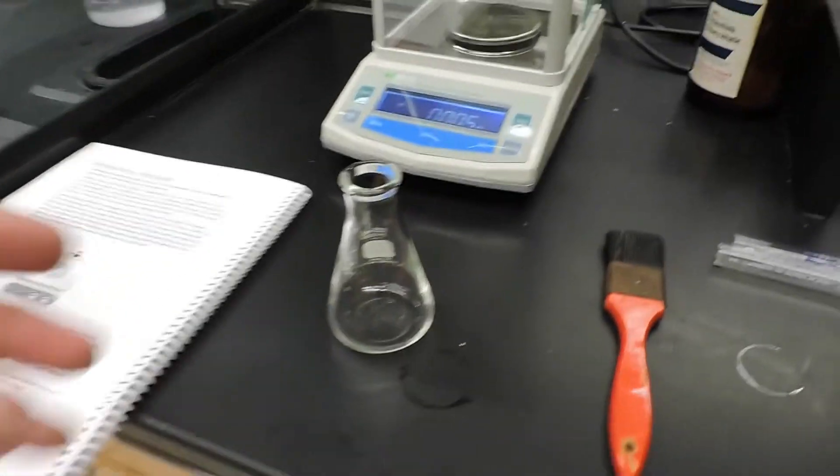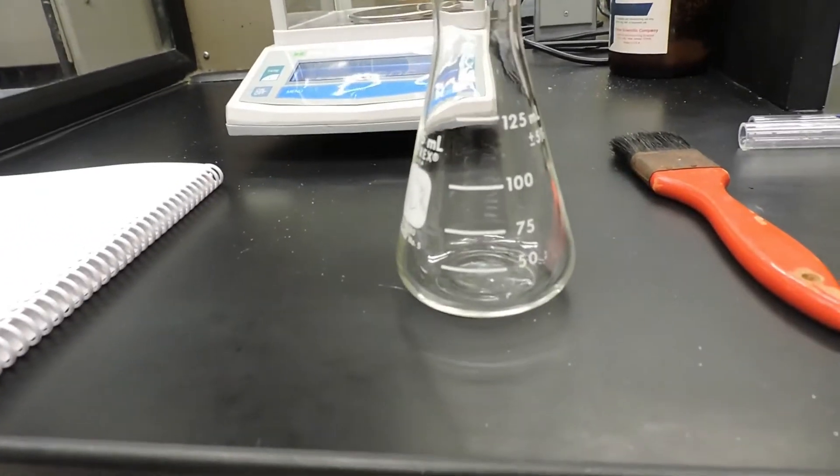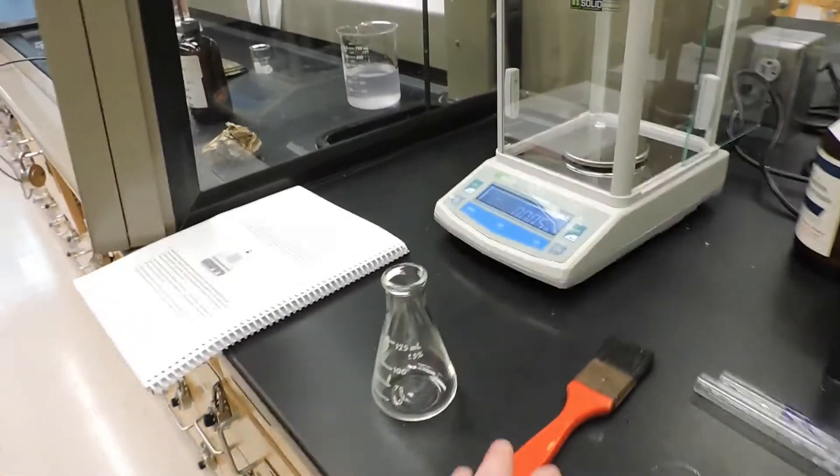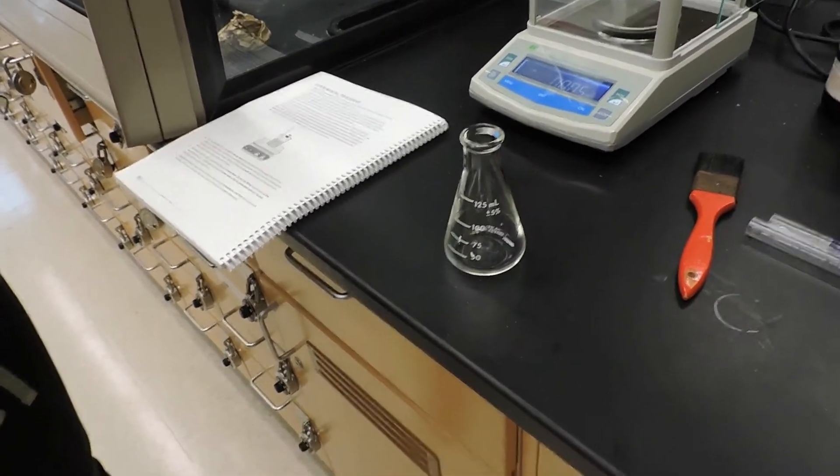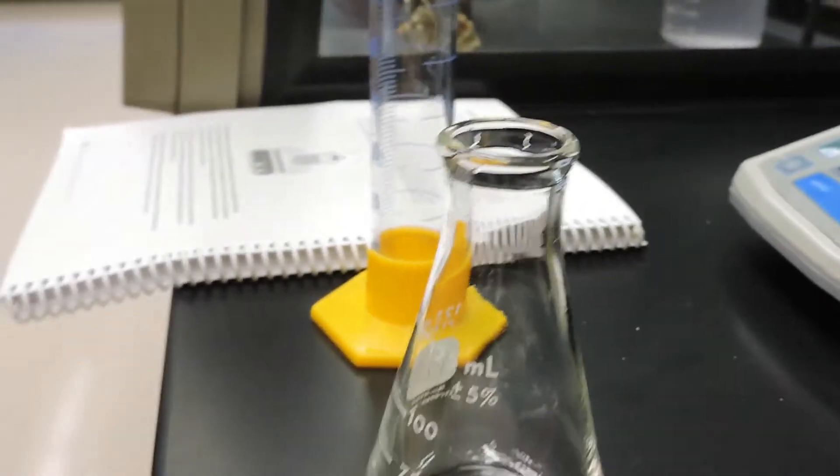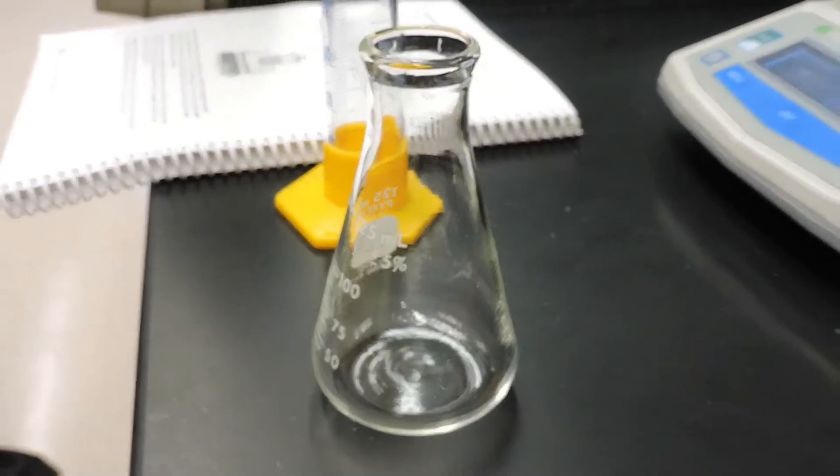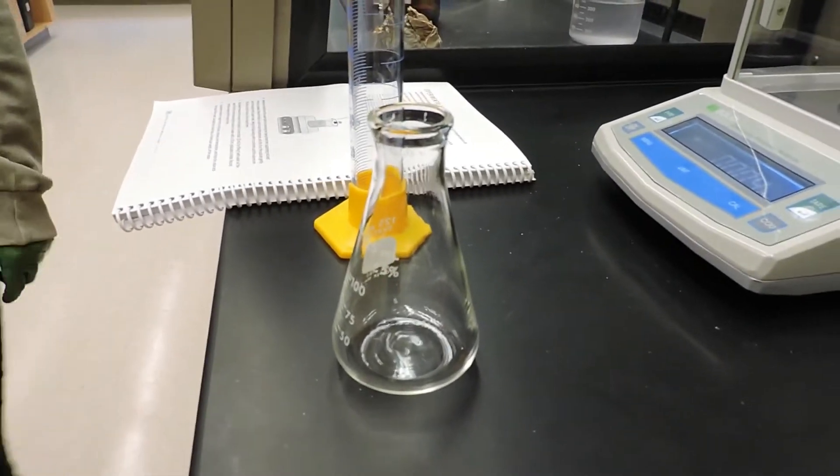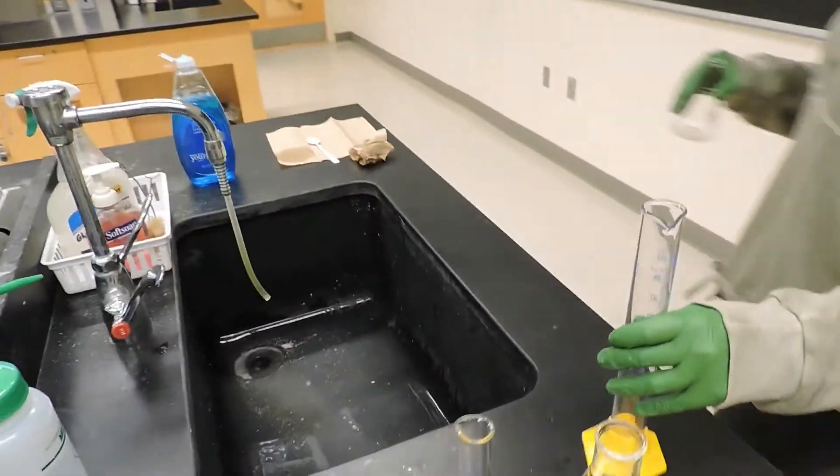It's also important for this lab to know the complete volume of the 125 milliliter Erlenmeyer flask. It may seem that a 125 milliliter Erlenmeyer flask is self-explanatory that it holds 125 milliliters, however a gas will actually fill the entirety of the Erlenmeyer flask. So we need to fill it with water to the brim to determine how much space is actually in the flask.